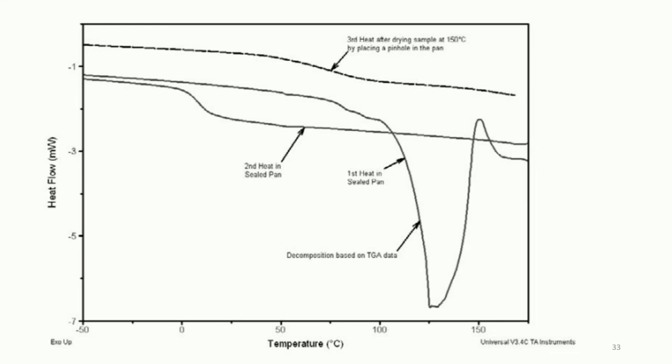The wide temperature range is due to the possible variation in moisture from batch to batch. This is where traditional DSC and modulated DSC perform different operations, and modulated gives more accurate results.